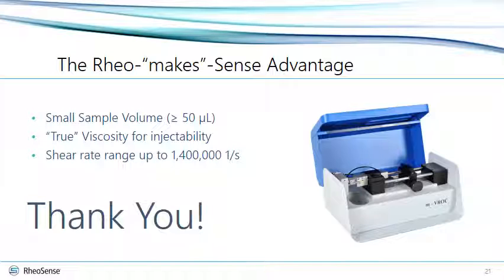For high shear rates, the following will be required. You will need a 1 ml or 10 ml syringe and jacket, and a chip capable of performing these high shear measurements. As an example, an EO4 chip with 40 micron channel depth with a 10 ml syringe will be capable of performing measurements from 100,000 inverse seconds to 1,400,000 inverse seconds for a sample that will be between 1 to 30 centipoise.